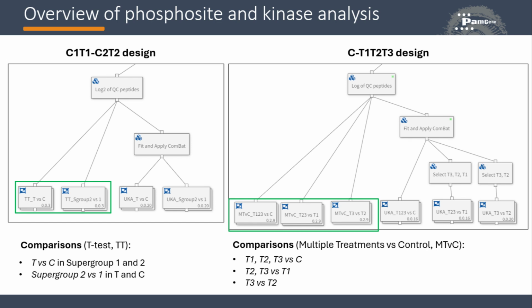You can also observe that phosphosite analysis is done on log or VSN data and not on batch-corrected data. We usually use ComBat correction only for upstream kinase analysis. Why is ComBat not done for phosphosite analysis? If there are batch effects, then we must take them into consideration. This can be done by batch correction or pairing. However, for phosphosite analysis, the best way to counteract batch effects is to do paired tests. Pairing counteracts batch effects, since we run statistical tests within a batch. If there is no batch effect, pairing is not needed.